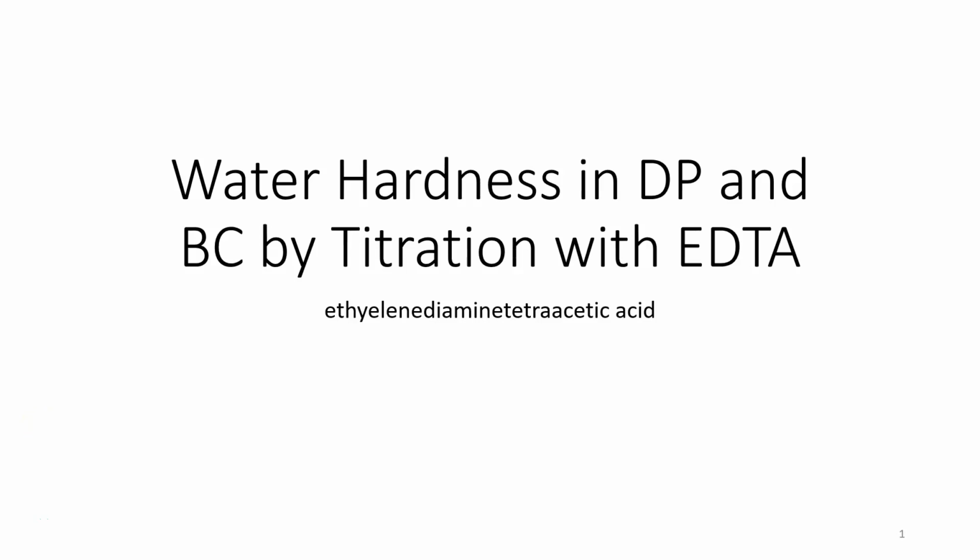Hi everyone. In this experiment, we're going to determine water hardness in Duck Pond and Boone Creek by titration with EDTA. EDTA stands for ethylenediaminetetraacetic acid.